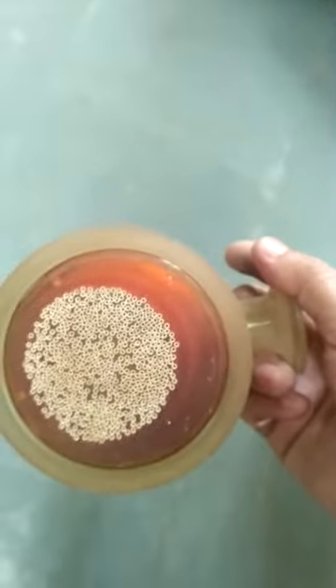There are very minute holes and the connections on this side go to the outside of those fibers — these two connections are from the shell side. The fibers are very small in diameter, just like threads. Inside, we can see they have been stacked and bound together using a plastic film.